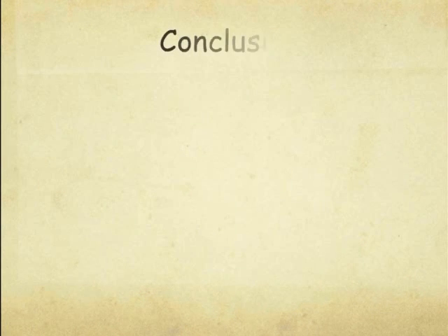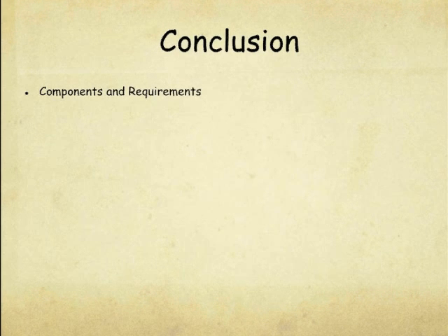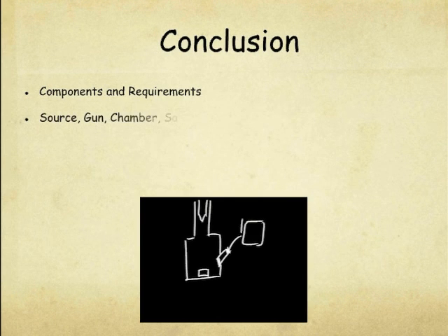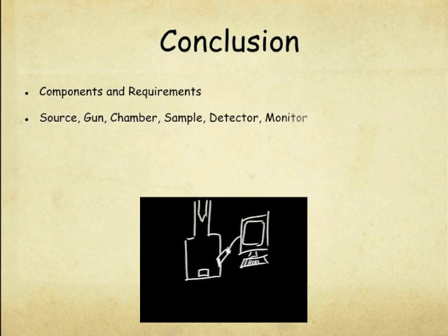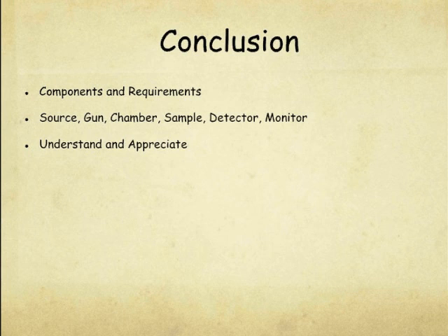Well, I hope you have enjoyed this introduction to scanning electron microscopy and discussion that range from critical components integral to SEM to major requirements and considerations of operation. This investigation has taken you from the high voltage source, through the gun column, through the chamber, down to the sample, through the detectors, and onto a monitor. I hope this discussion was engaging and relevant to you all, and you can walk away having a better understanding and appreciation for scanning electron microscopy and the associated principles.